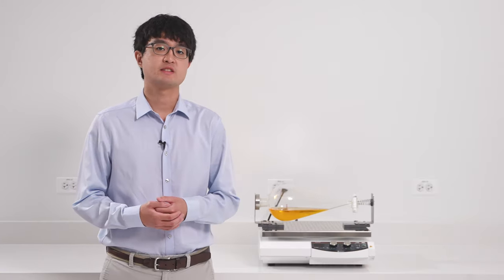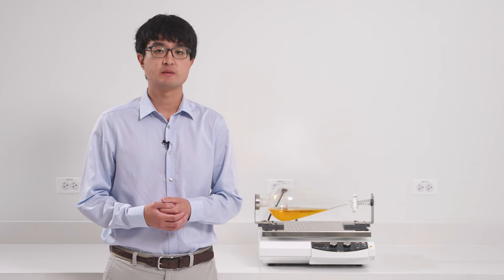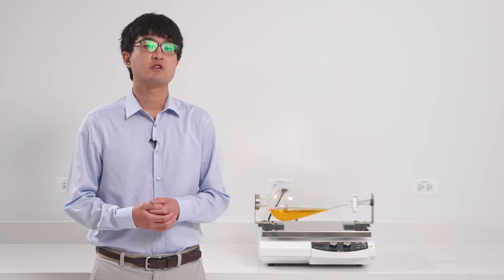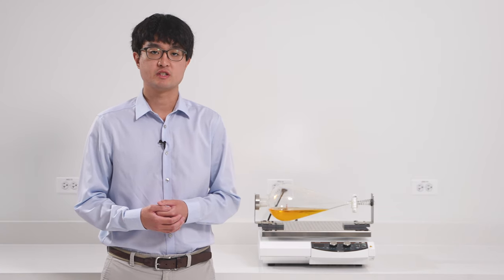Today we'll be talking about our separatory funnel attachment. The Prove Max series is our reciprocating platform shaker, making it suitable for phase separation and different distillation experiments. Therefore, Hyduff offers a separatory funnel attachment.